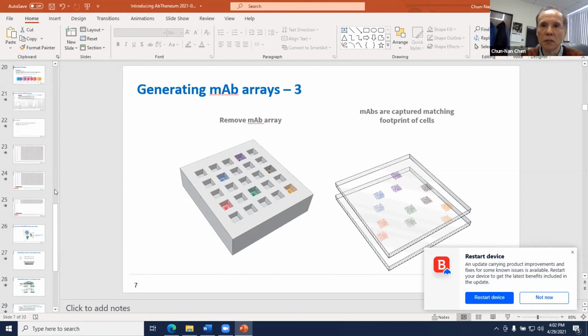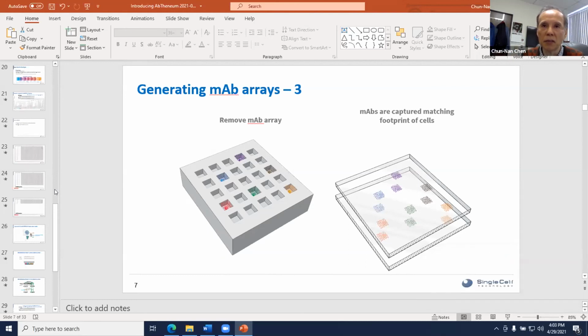So most of these binding agents that we have are pretty good, especially some of the secondary antibodies from goat or some of the other animals. Those have an average KD of 1 nanomolar. So the binding capacity and efficiency is quite high.